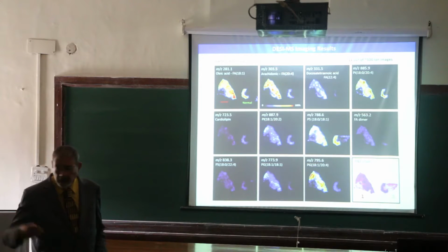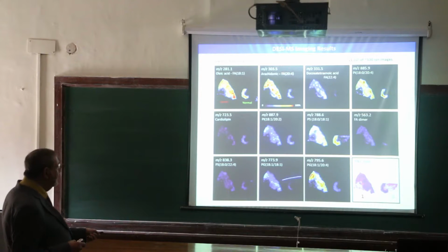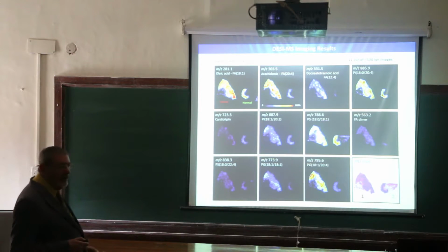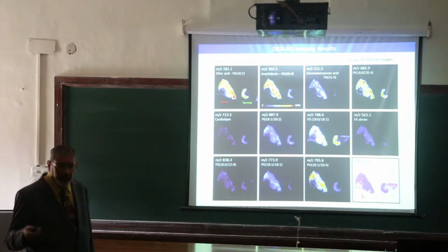So, right? And so here's something called arachidonic acid, and it is a fatty acid that has 20 carbon atoms, one chain that has 4 double bonds. That's this type of notation. Here's another one that has 2 chains, 18-0, 18-1. This one means that there's 1 double bond. And we see different distributions, and you can see the names of these things. How do we know this? As I say, we've identified easily 100 different compounds this way.